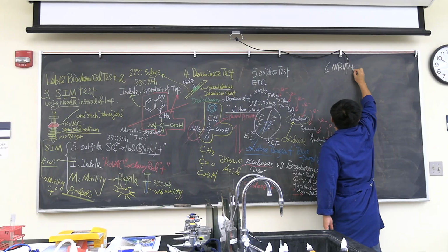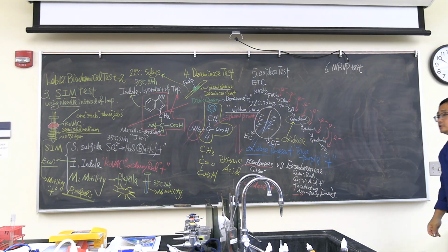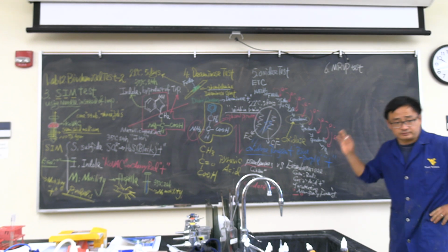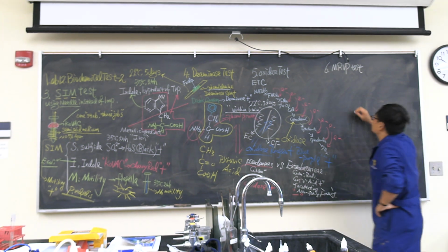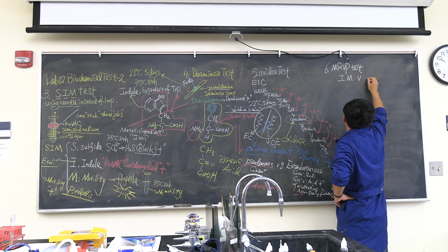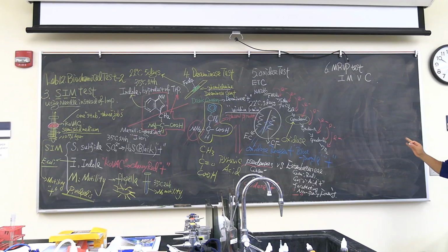MRVP test. That's the last one. Okay, no more, because otherwise you're going to be confused. And no more Blackboard. So that's the last one. The MRVP test is part of a group of tests called IMVC. That is part of that test.